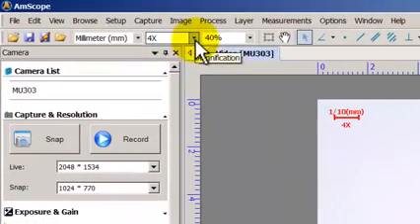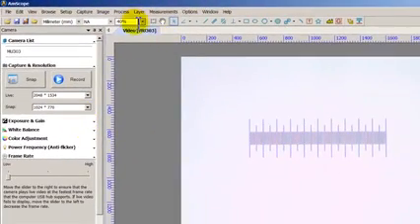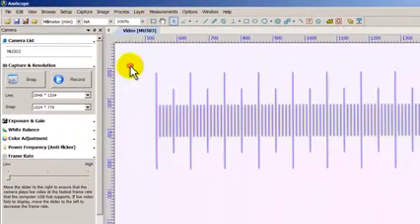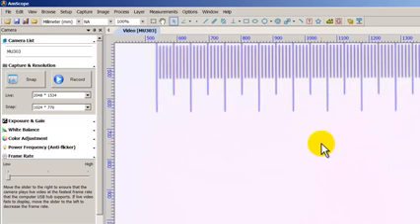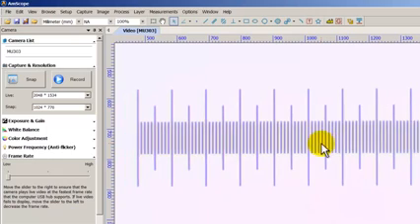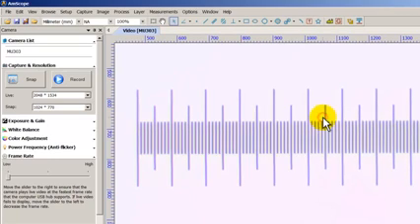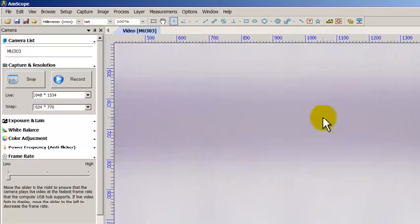And up here I'm going to change the magnification back to NA, and I'm going to change it to 100%. And I'm going to go ahead and refocus real quick. And now we do the same step as we did before. So you would go to Options, Calibrate. The magnification is still 4, so let me go ahead and bring it onto the 10x objective.